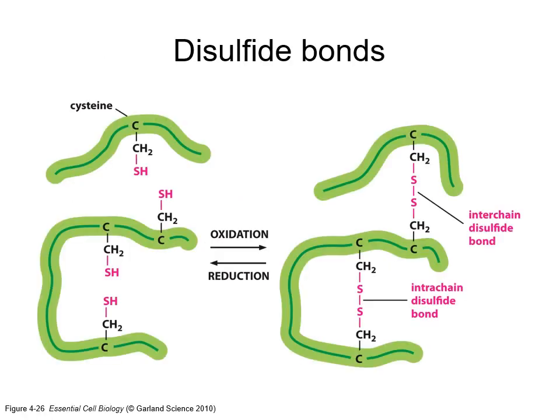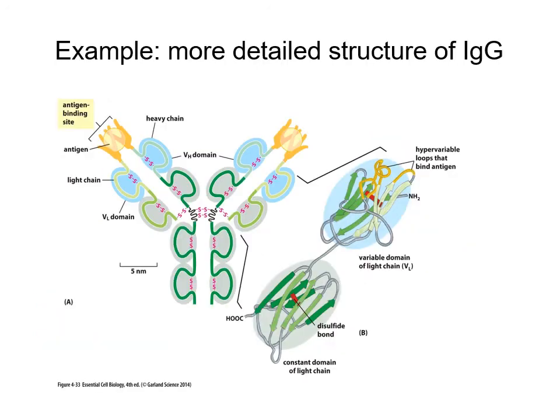Okay, here's our disulfides. Again, here's what a cysteine looks like. If we have the two of them connected by disulfide bonds, we need to break those, and that's what the dithiothreitol or beta-mercaptoethanol will do, to separate those subunits from each other, and also to get rid of any crosslinks within the molecule that will interfere with its proper physical conformation.